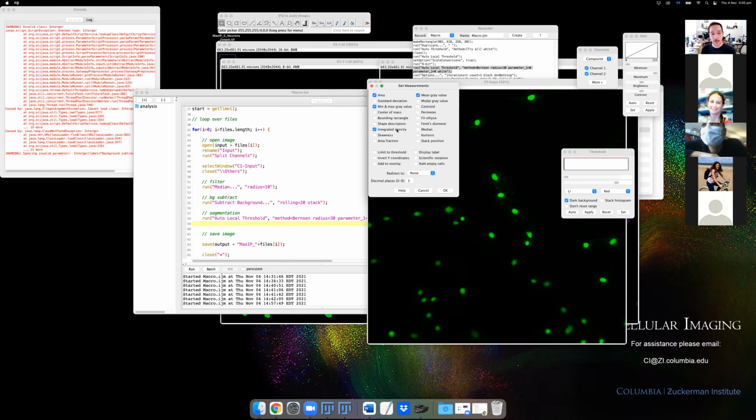This is the intensity based on the area. If you just take the mean intensity of something, that's just telling you how bright it is, but it's also a function of how big it is. A really good case: these are images from a wide field microscope, so the measurements we're making of these nuclei are really of the total nucleus. So we can make a measurement of the total intensity in this nucleus. We might be tempted to think that these small bright ones are expressing more protein, but really it's just potentially the same amount of protein in a smaller volume. Integrated density will let you get a measure of that intensity according to the area. That way, if there really is equivalent expression despite the size, those integrated density values will be fairly equivalent. So it's something to keep in mind if you're making measurements like this.